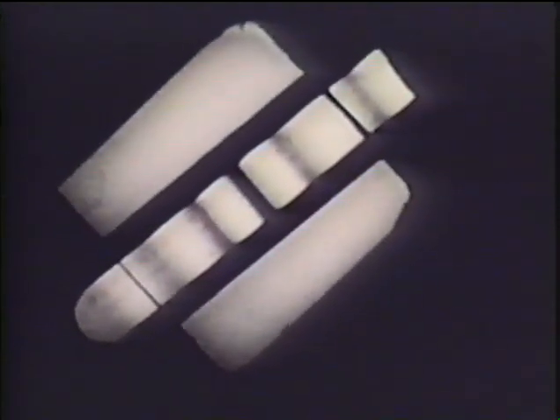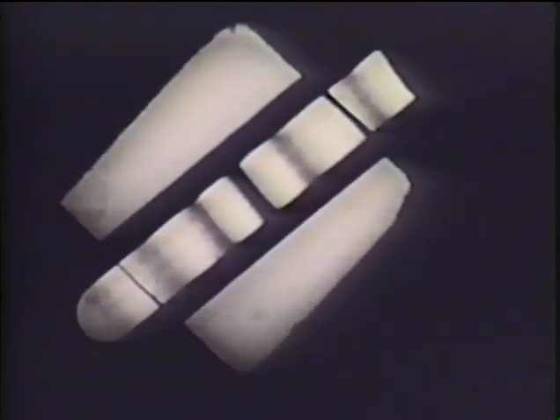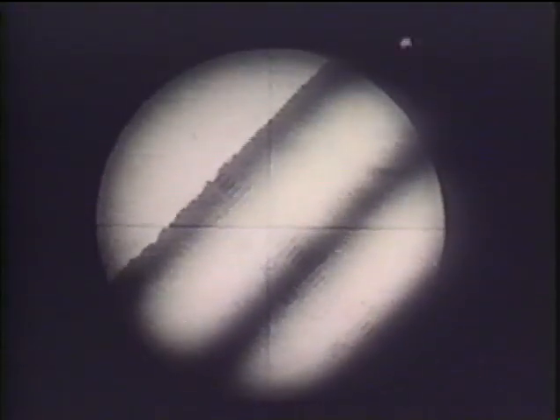When a quartz wedge is compensating a crystal at the 45 degree position, the exact thickness which gives complete compensation is marked by a dark band. The position of this compensation band can be read on a scale engraved along the wedge.